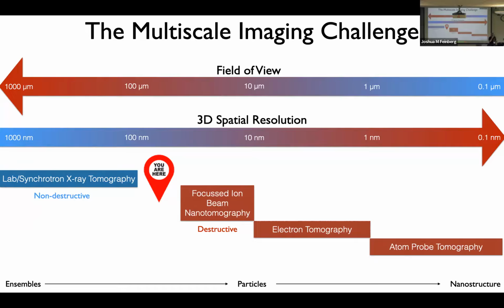So we've been thinking of ways around this, and the simplest way is to not use 3D imaging, okay? The trade-off does not exist for 2D imaging. We can do SEM imaging at very high spatial resolution, and we can take those images across an arbitrarily wide field of view. We just have to take a lot of images tiled across the entire thin section, okay?